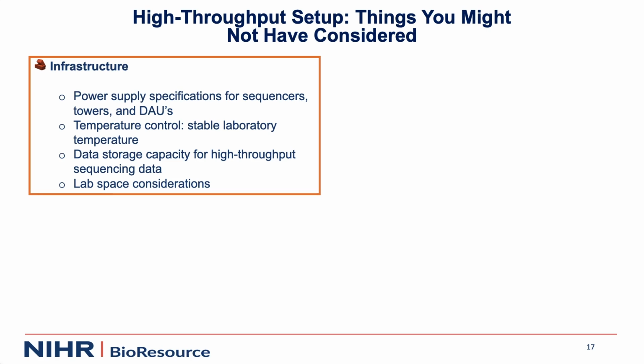The other thing is that these projects make a lot of data, so you need plans for keeping all that data, as well as for the actual downstream analysis. And as Tilda mentioned, there's quite a lot of other lab equipment just to do the library prep that you need space for as well.